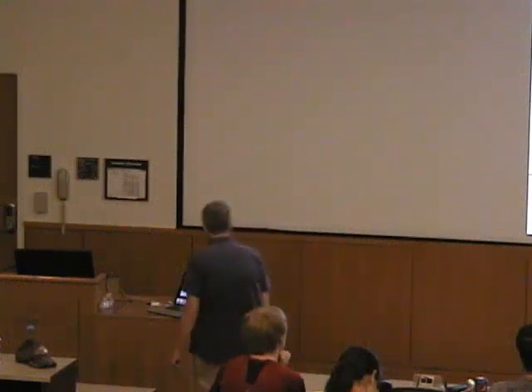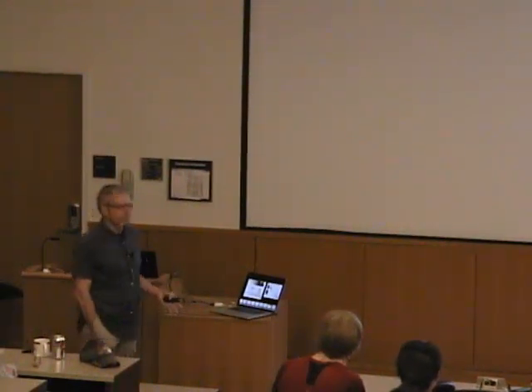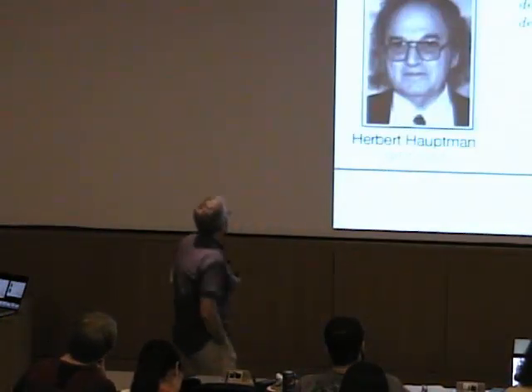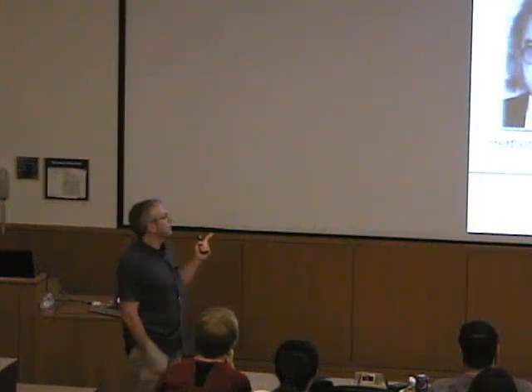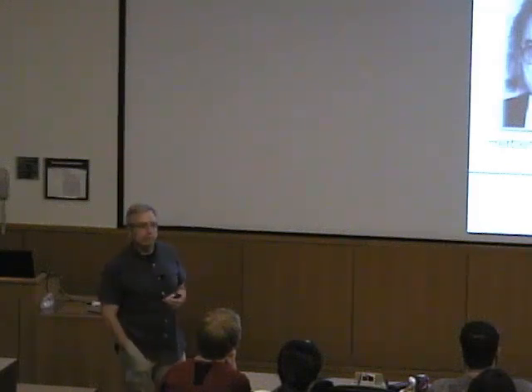Okay. That's not good. However, we do solve structures once in a while, so there must be a way around that, right? So see it positive. Question is, how is this phase information obtained? Well, okay. For small molecules, the problem is solved. And the problem is solved for small molecules because of these two gentlemen, Jerome Karle and Herbert Hauptman, whom I have to abuse a bit now, because these are the pictures I found, and I was always too lazy to make my own. They got the Nobel Prize for Chemistry in 1985 for solving the phase problem for small molecules.